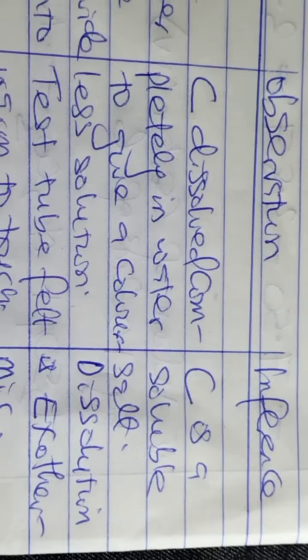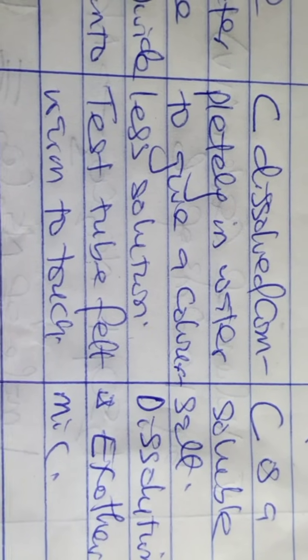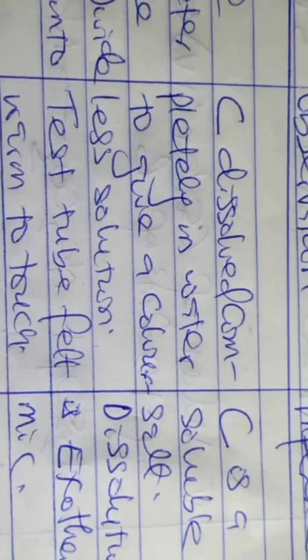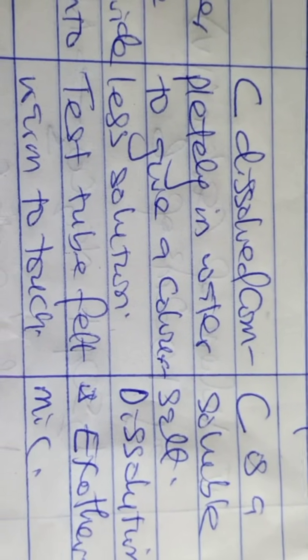So let's go to test 1 that says add C to 5 cm³ of distilled water and shake thoroughly. Divide the solution into 2 portions. Observation: C dissolved completely in water to give a colorless solution. Test tube felt warm to touch. So when we do the live practical, that's what we observe. C dissolved completely in water to give a colorless solution.